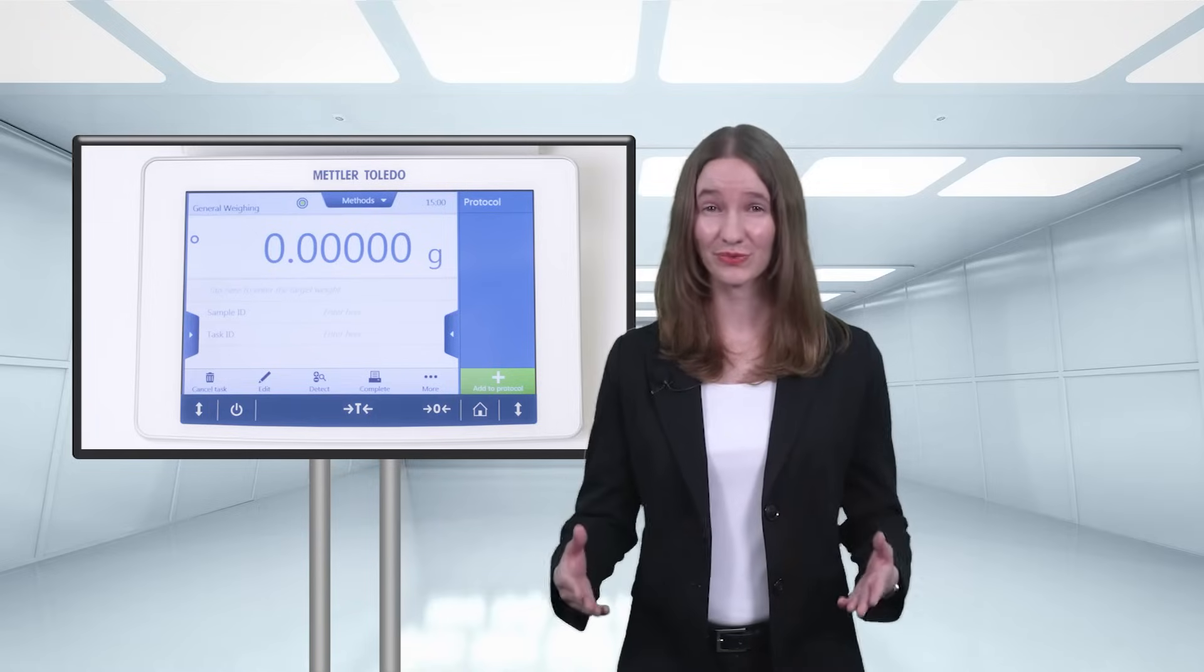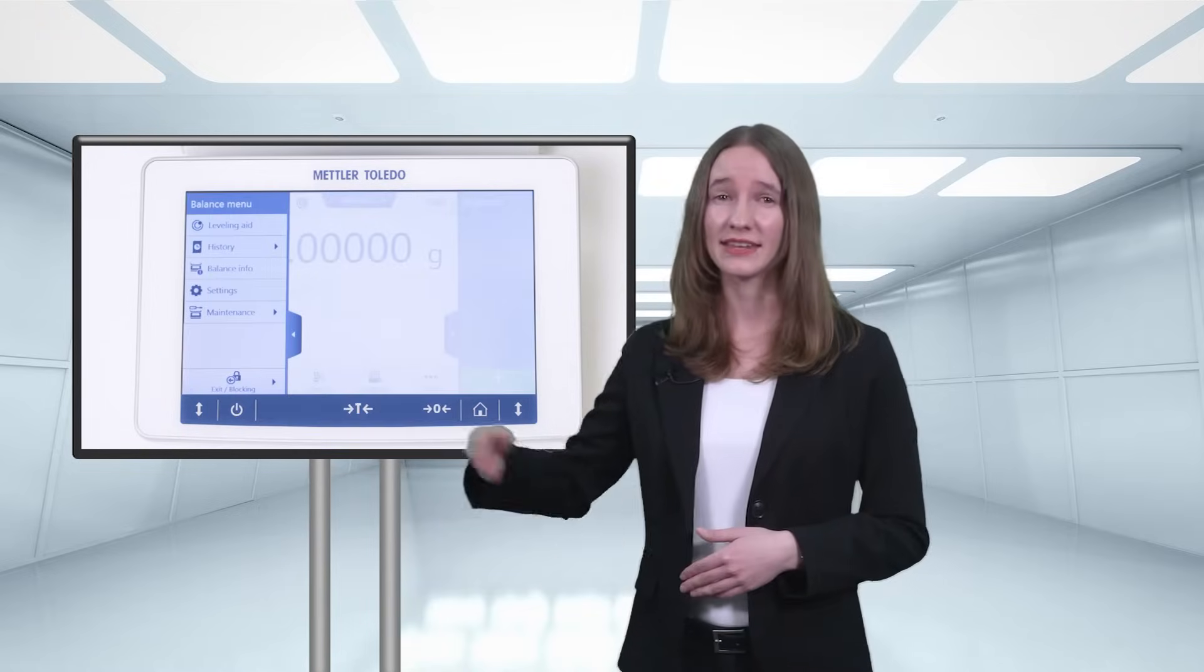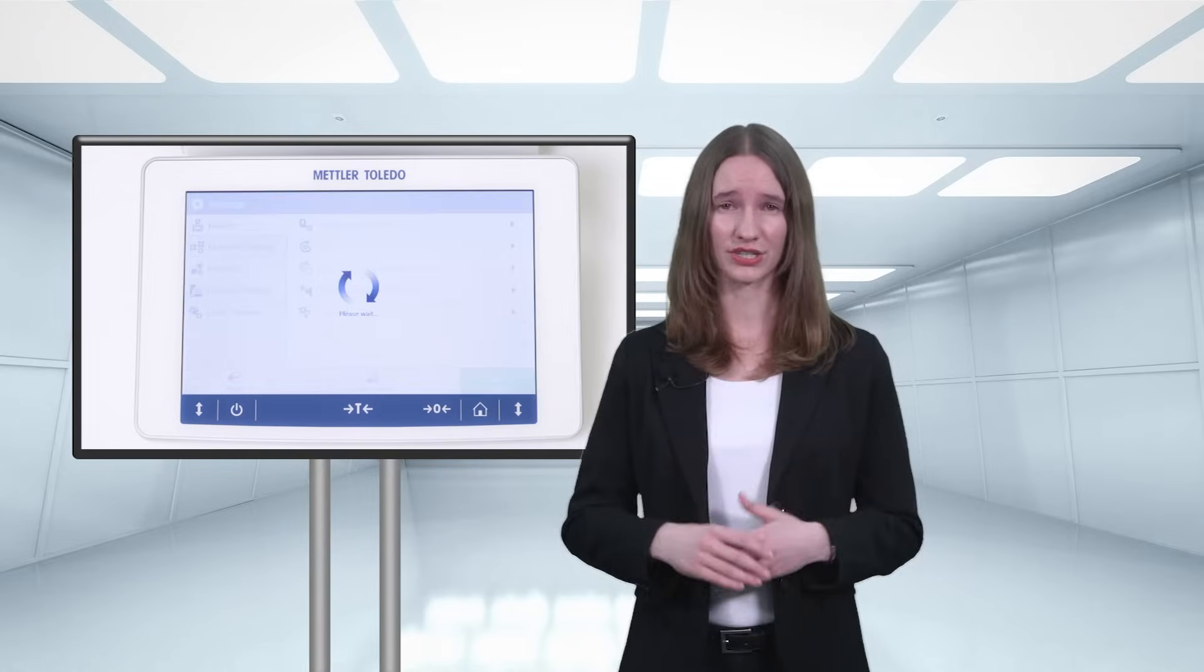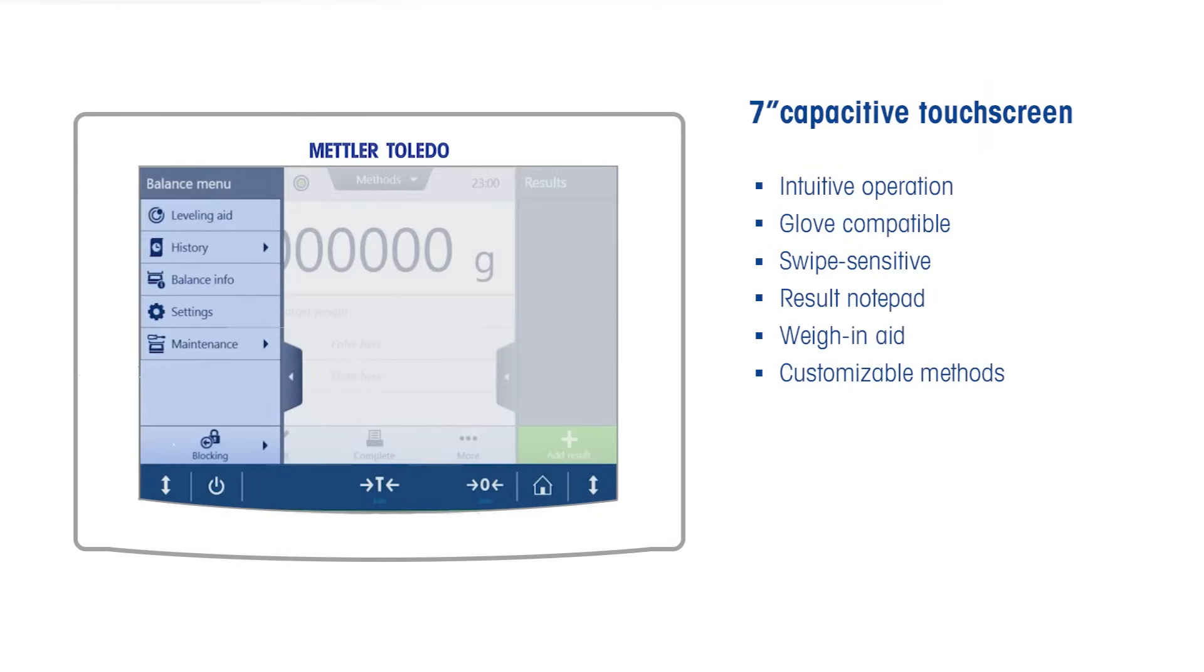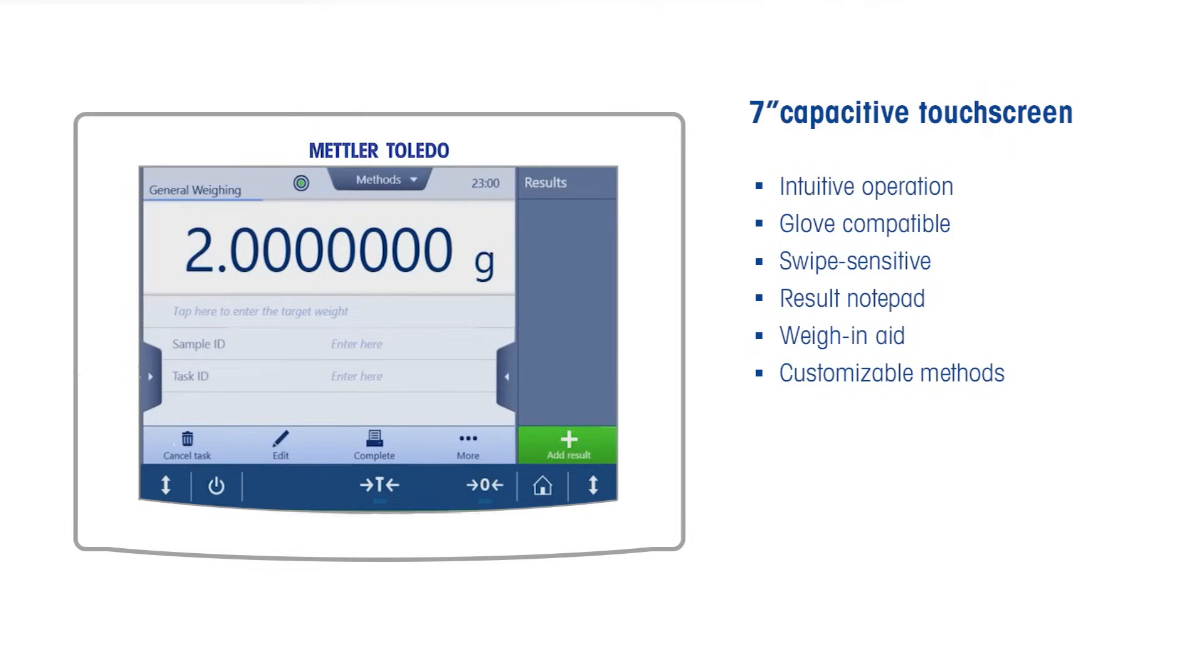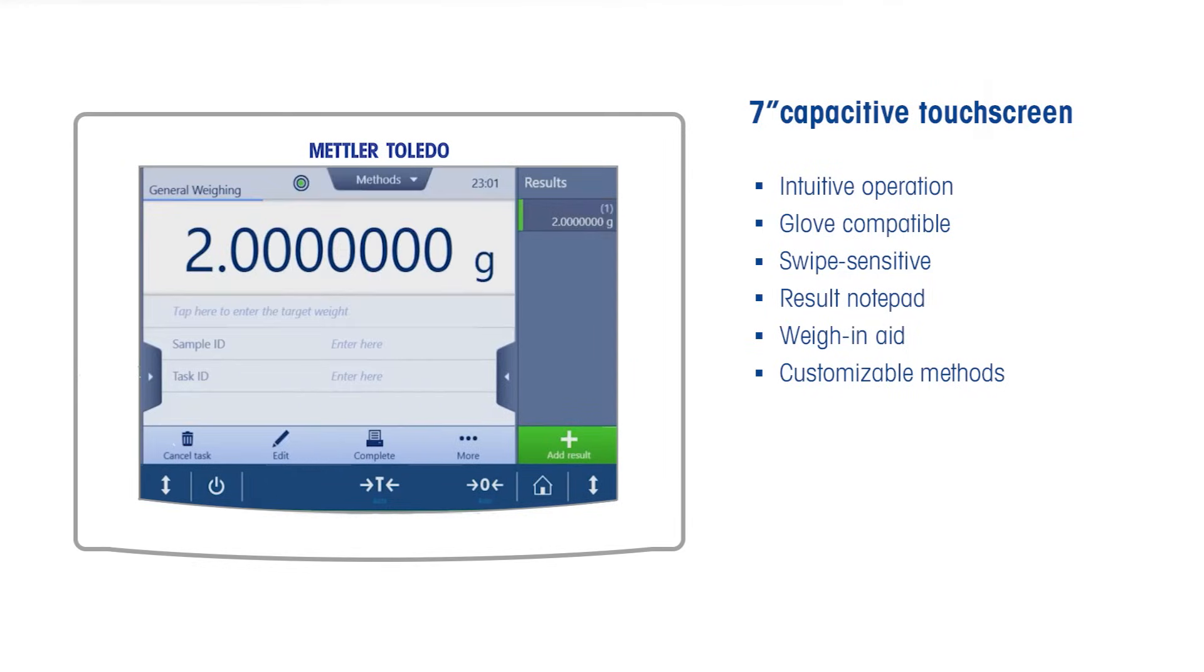Of course, we did not stop at improving the hardware, but continued with the user interface. The XPR's large colored touchscreen is as intuitive as your smartphone and works even when wearing thick gloves. With just one swipe, you can enter the menu, methods, and result notepad, where you see all your measurement details, giving you an overview over your completed tasks anytime.